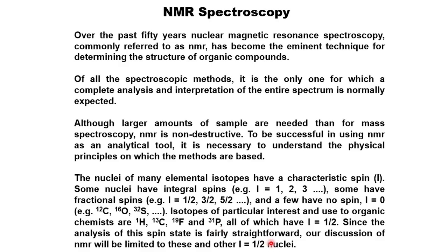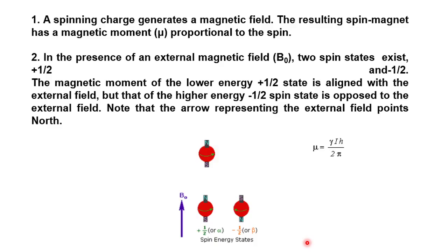Since the analysis of this spin state is fairly straightforward, our discussion will be limited to this and other I equal to half nuclei.